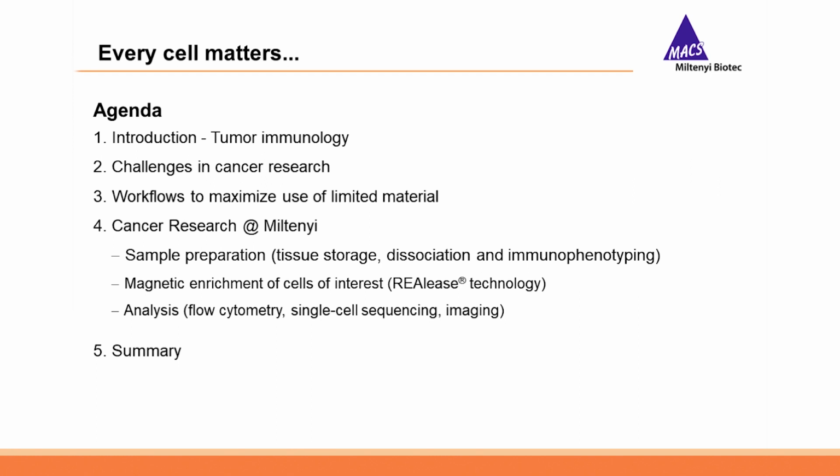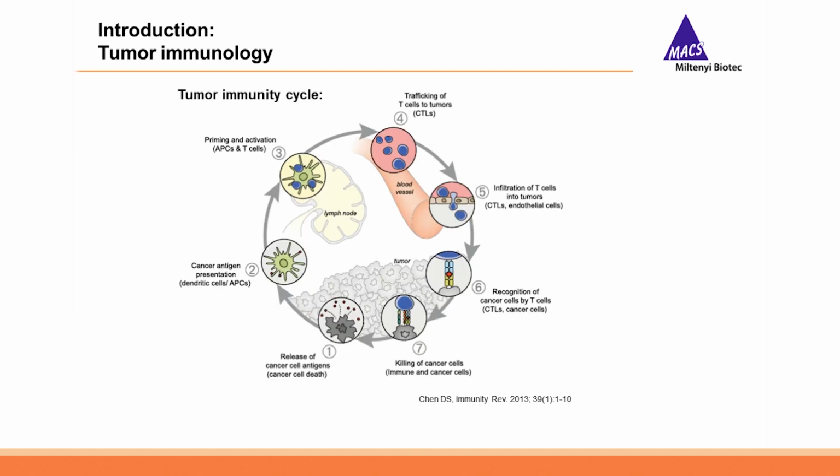I will start by giving a short introduction, followed by identifying some of the challenges faced when conducting cancer research and how we developed workflows to overcome those challenges. I will then zoom in on some of those workflows and detail some of the tools we use for sample preparation, magnetic enrichment, and analysis of the populations of interest.